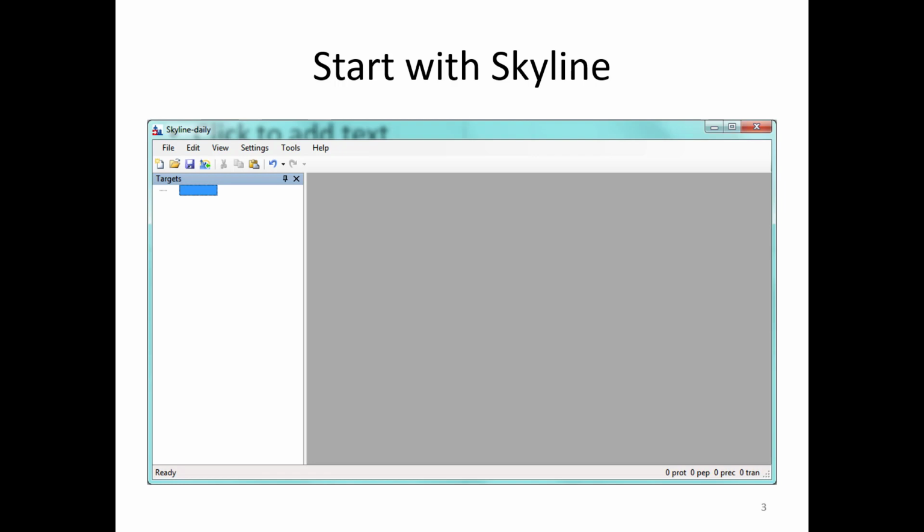So please, everybody, open up the Skyline program, and you will get to a blank document option. Click on it, and you should get something that looks like this. Let me know when you're ready. Good, all right? That part's not that hard.